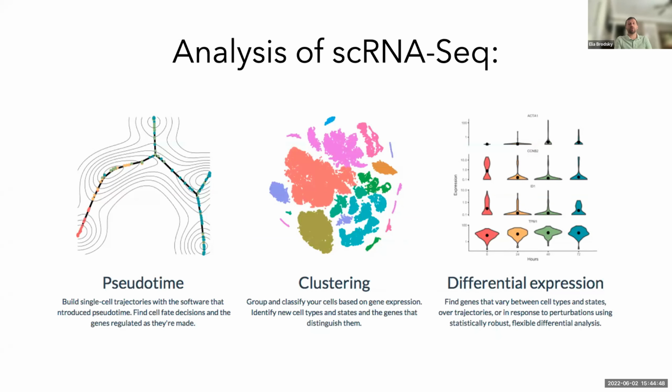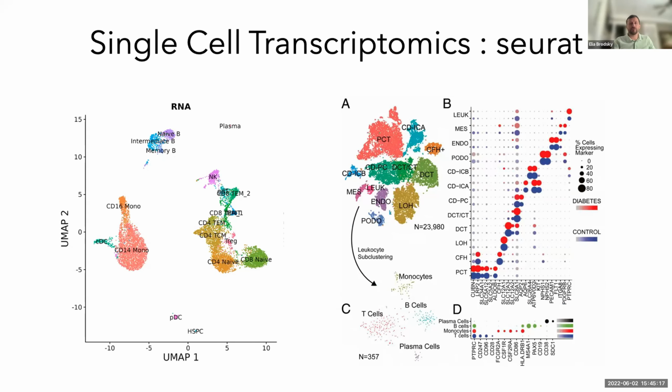So we will look at how we can use such methods of dimensionality reduction to start asking biological questions, going back to the statistical comparisons that we've explored in the bulk RNA-seq course, and how we can then also ask additional questions about, for example, pseudotime. How can we track trajectories where gene expression levels actually represent a continuous process? Then we will look at the full pipeline again, from understanding of what is in our data to then being able to ask specific questions, and then all the way to downstream interpretation.